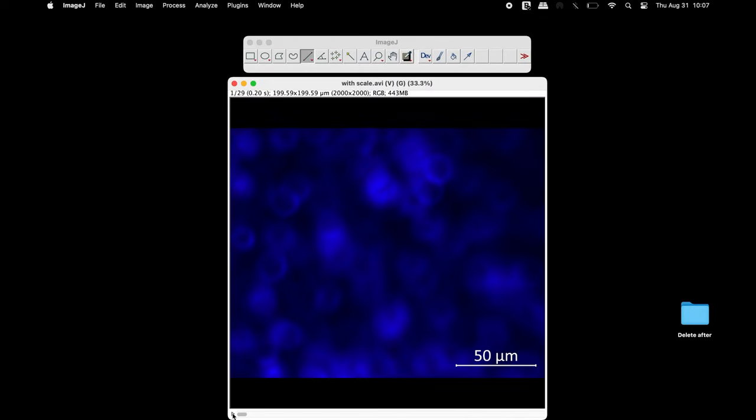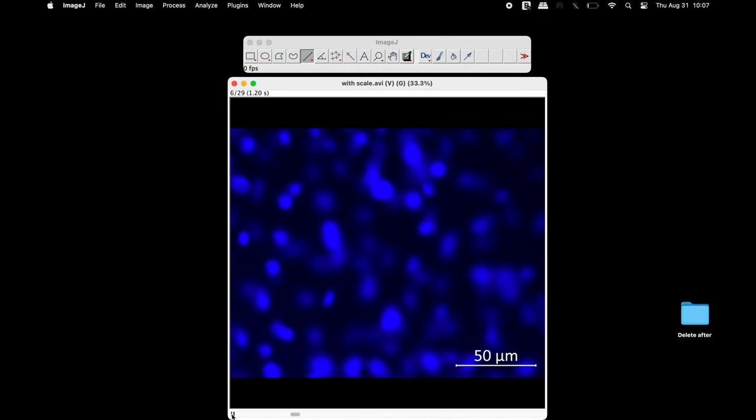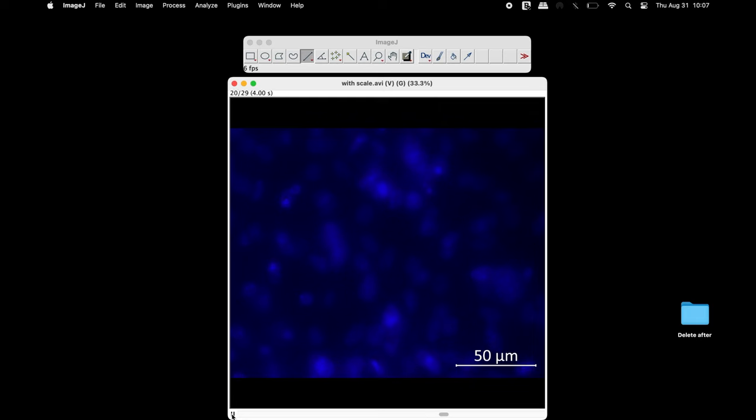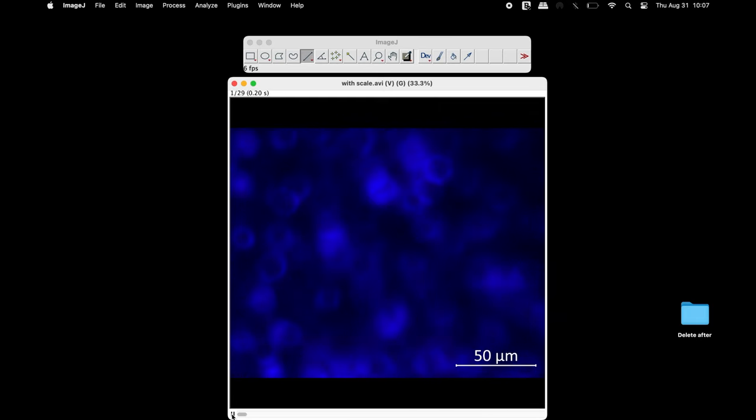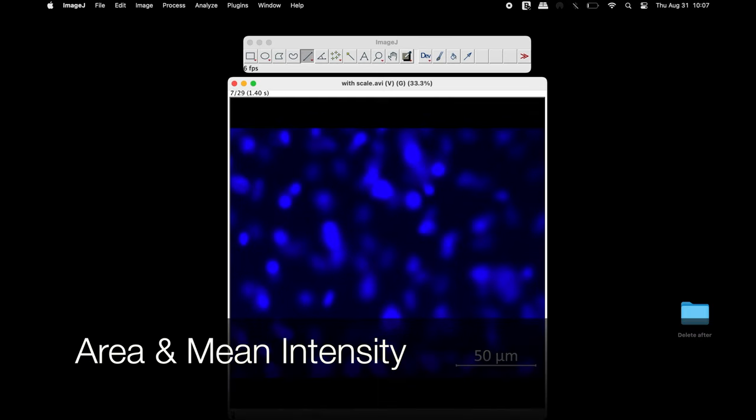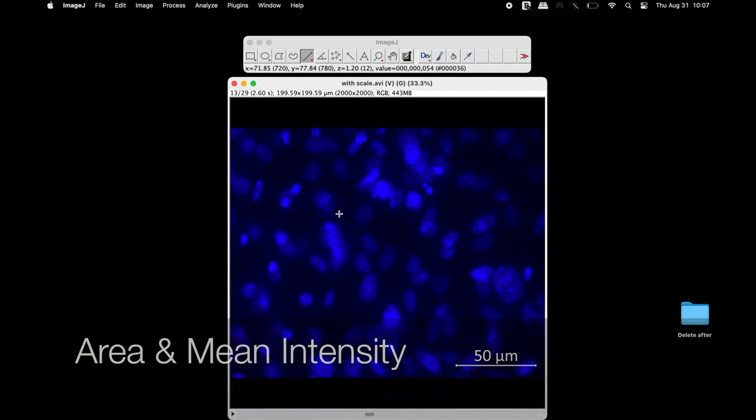Here is a stacked image with 29 slices and we will use ImageJ to measure the area and mean intensity of the DAPI stained nuclei.